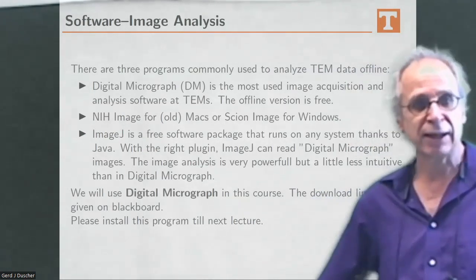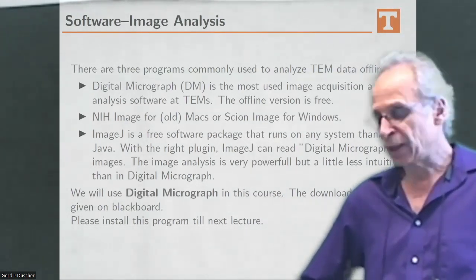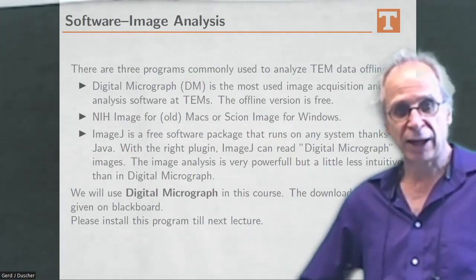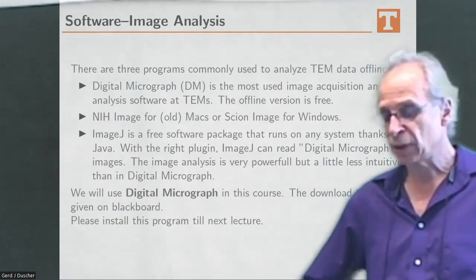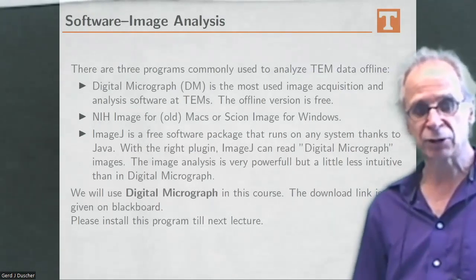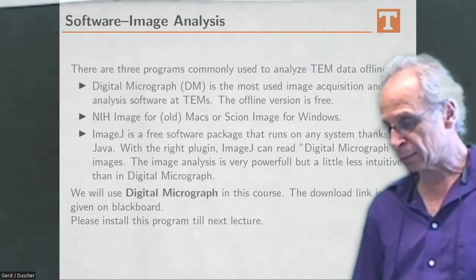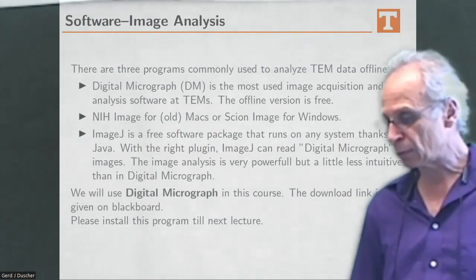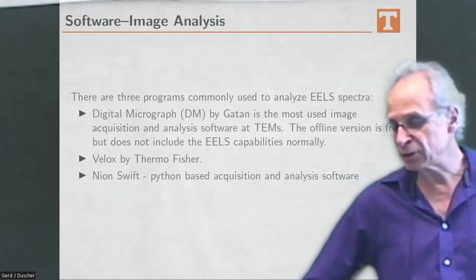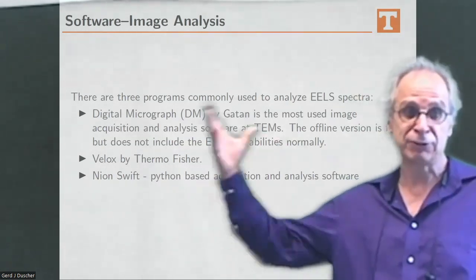So we have some software analysis tools, then a few other ones. Digital Micrograph is available offline, free of charge. That is one of the most used transmission electron microscopy software tools. Then on the other microscopes, there is Velox on the Thermo Fisher, formerly FEI, or before that, Philips.